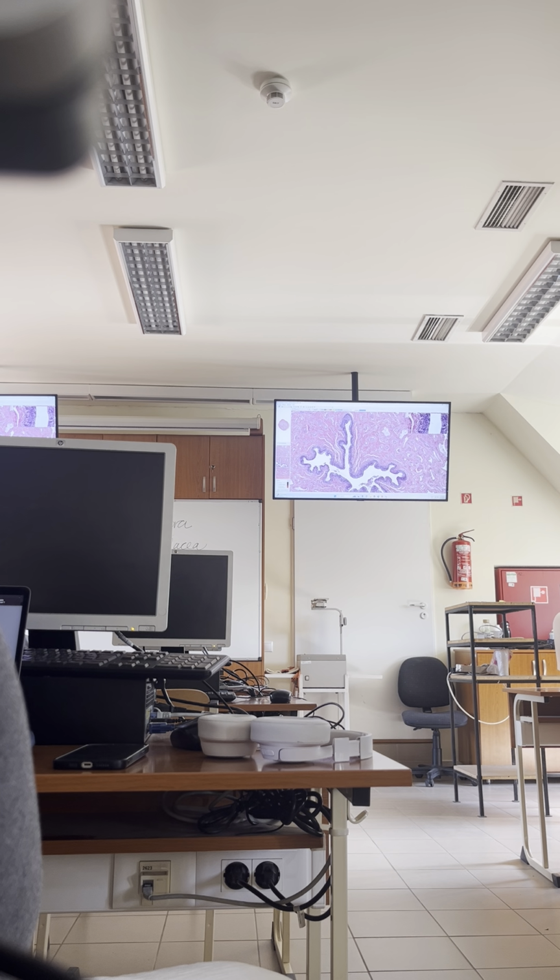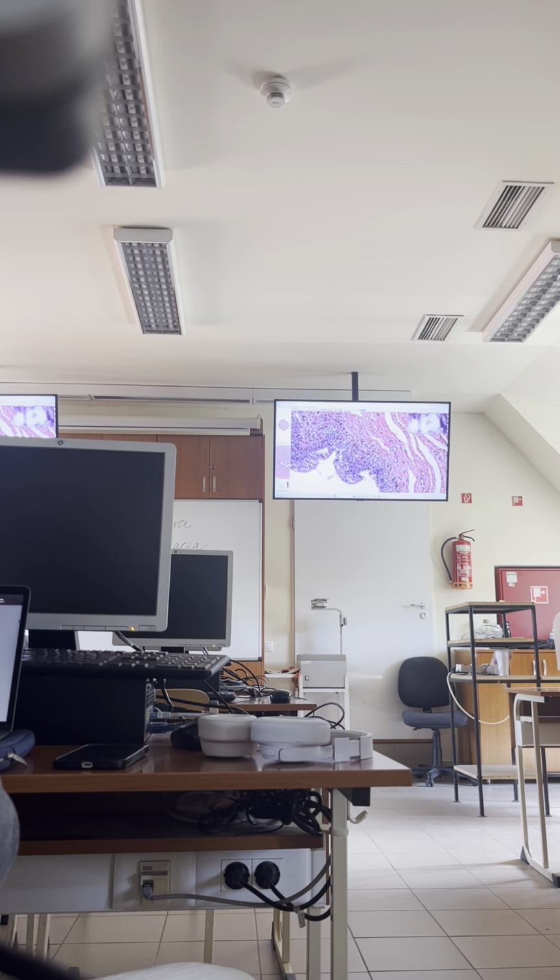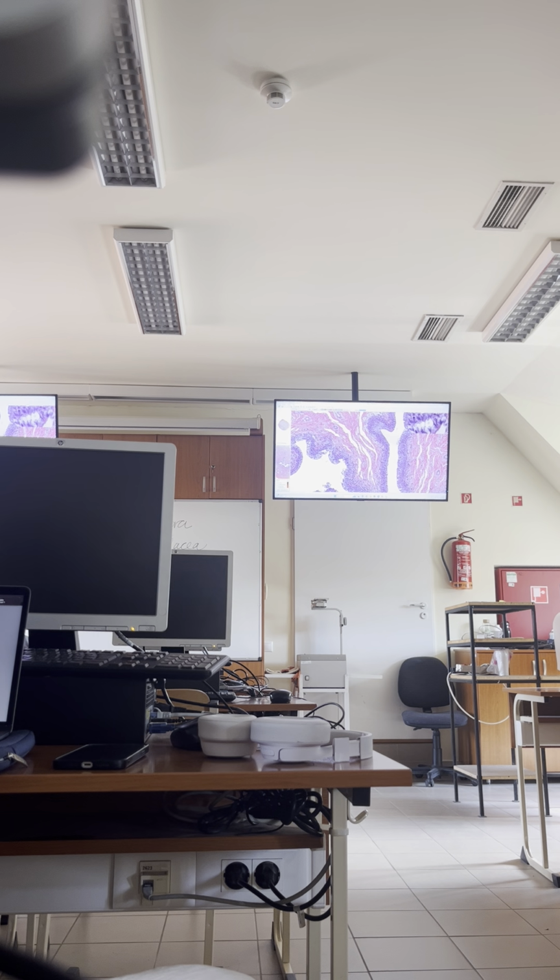Inside this epithelium, there are endoepithelial glands, which are pale-stained cell masses, multicellular glands, because they are mucus-producing glands. Mucin was lost during formalin fixation. And they are called endoepithelial because they are inside the lining epithelium, in this case inside the lining epithelium of the male urethra.